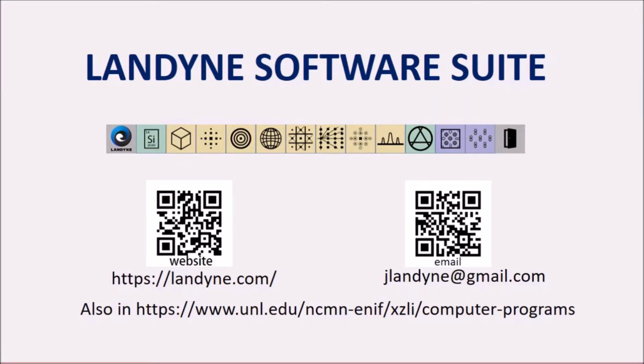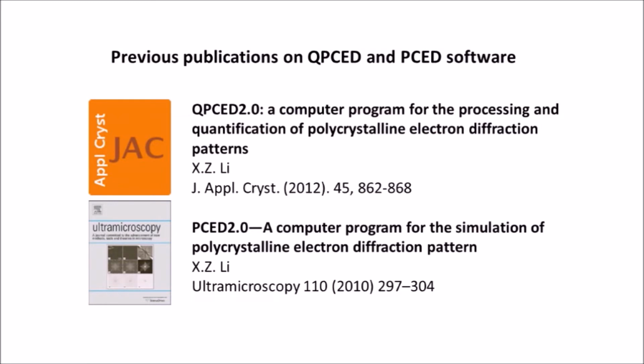In this tutorial video, I will introduce QPCED, a computer software for quantification and processing of polycrystalline electron diffraction patterns. You may download the software suite from the website on the screen.